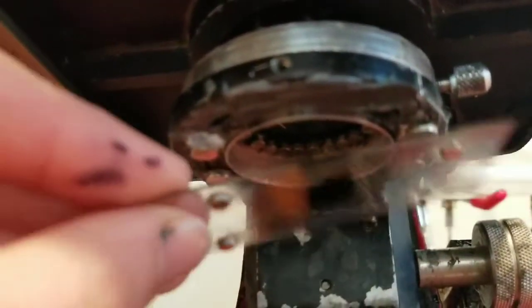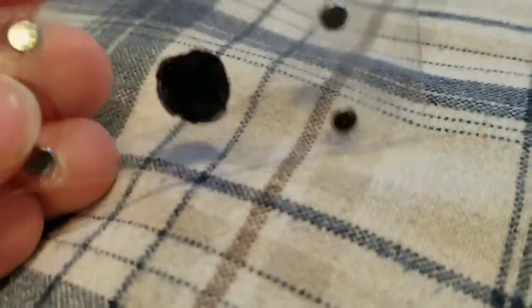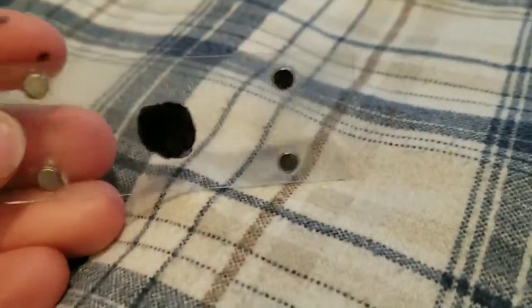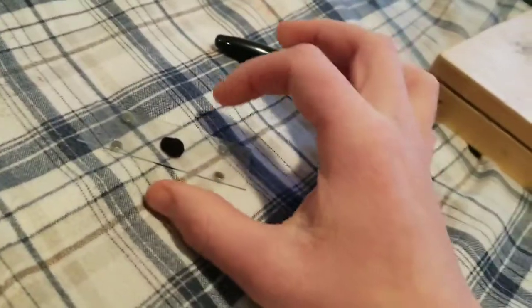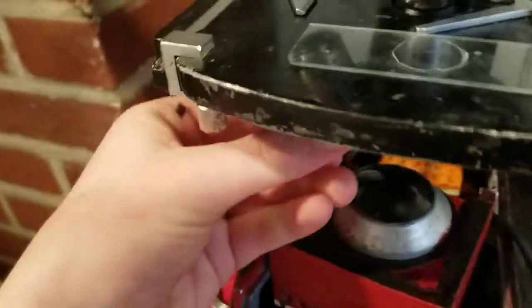So what I did was I added magnets on the bottom of this, and then I made this. As you can see, this right here is glass, which does not mess with polarization in the same way or to the same degree that plastic does, meaning that I could potentially use glass. So this is glass with Sharpie painted on it, and I cut out different sizes of tape circles, and I did a bunch of experimentation to find the right sizes.